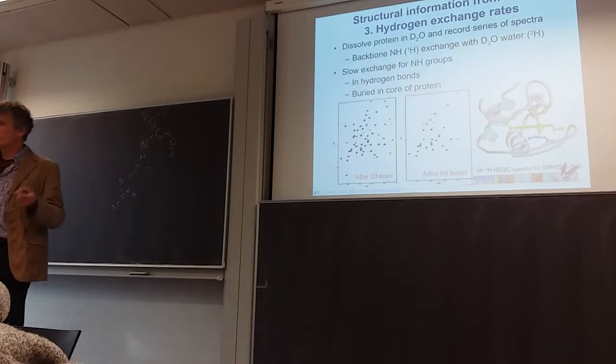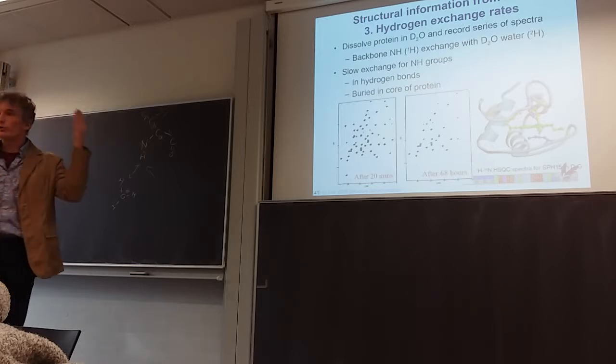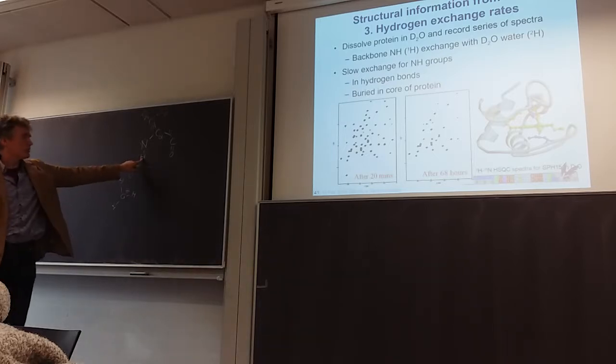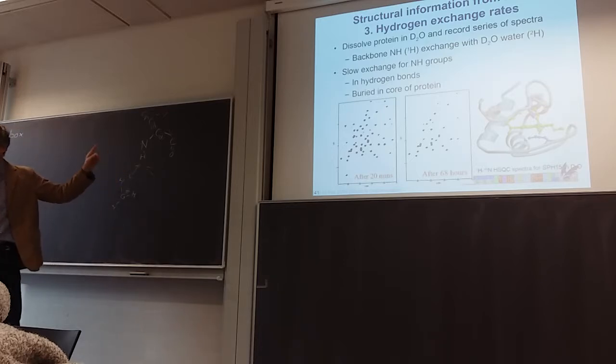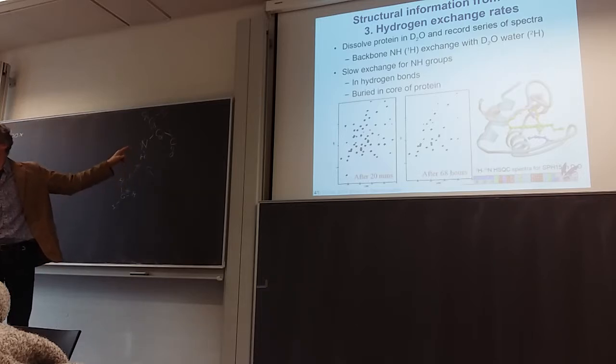Acid-base equilibrium that you have in protein chemistry. Now, if you put the protein in D2O, the proton will detach, and most likely, because most of the water is D2O, you won't get a proton back, but you get a deuteron back. So you lose the signal of these backbone nitrogen protons.